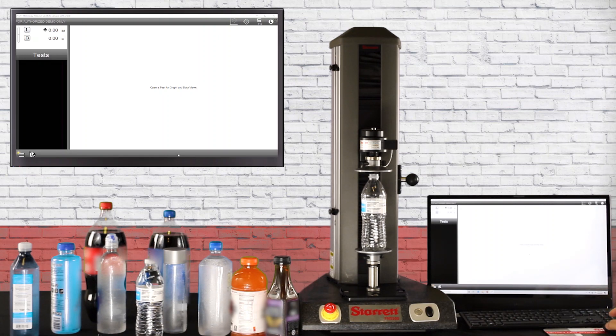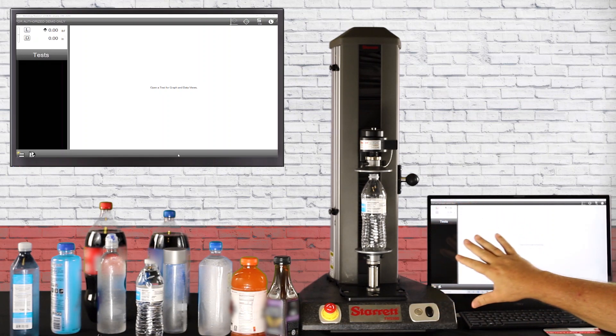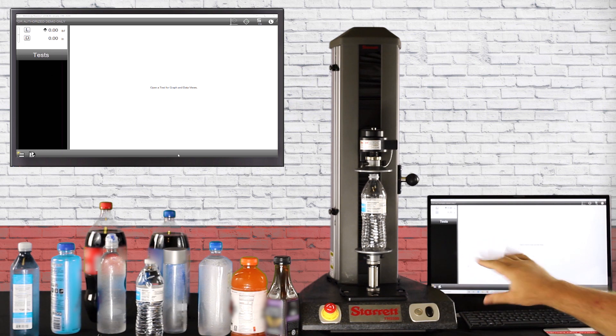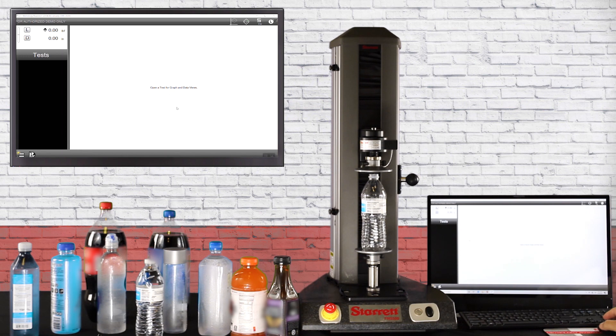Okay, welcome back. We're going to make the program now as you can see we've set up everything. I'm going to be off frame for this particular shot so you can see more of the screen and the testers. Let's get started.